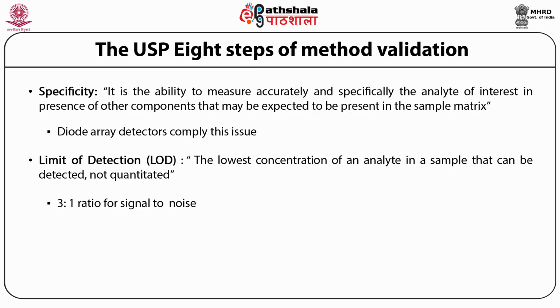It can also be done by another equation. LOD is equal to 3.3 times SD by S, where S is the slope, and SD is the standard deviation of a standard calibration curve.